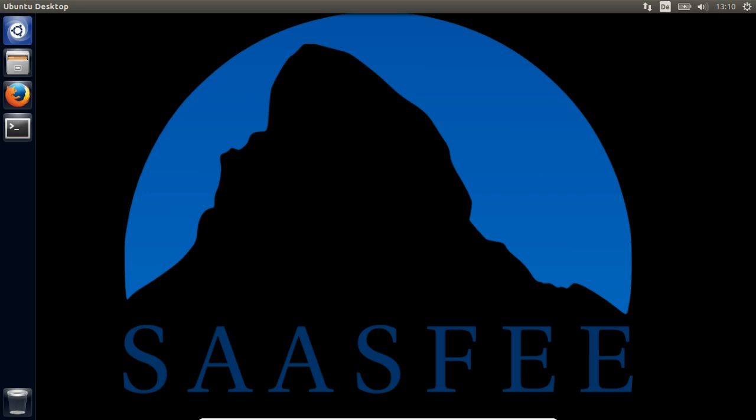Hello and welcome back to our series of tutorials on how to use the scalable workflow execution engine Saasfee. In the last tutorial, we gave an introduction to the functional workflow language Cuneiform. This time around, we will encounter the other major component of Saasfee, the Highway workflow scheduler for Hadoop Yarn.